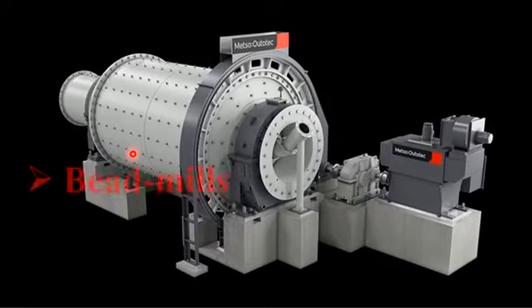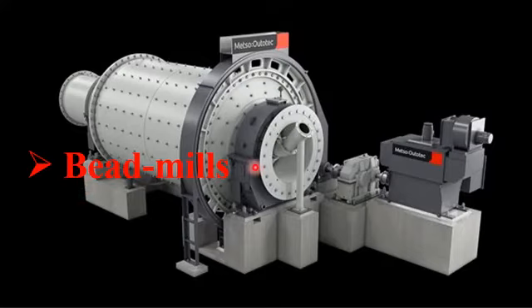Another common type of milling machine used for the conversion of bulk material is known as the bead mill machine. Students, please note that the bead mill machine is very common in crushing a bulk material into a fine powder. It is very common in the cement industry and also in different types of micro and nano electronic industries.